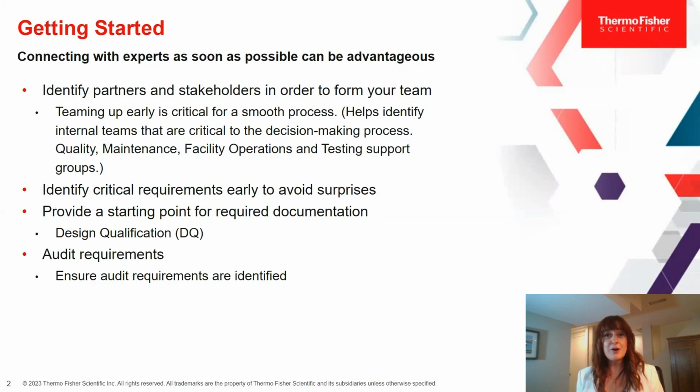And second of all, we want to talk about this because if you're taking care of your cold storage and you've selected it with all of these, we're going to go through 10 steps that will help you. You can actually reduce your cost of ownership for the products over time. So think about it from both keeping your research up and running and setting you up for success in that format, but also from an operations standpoint. Hopefully these tips will help you set yourself up for success and hopefully reduce the cost of ownership over the long term. So getting started, you want to think about your cold storage requirements by answering a series of questions.